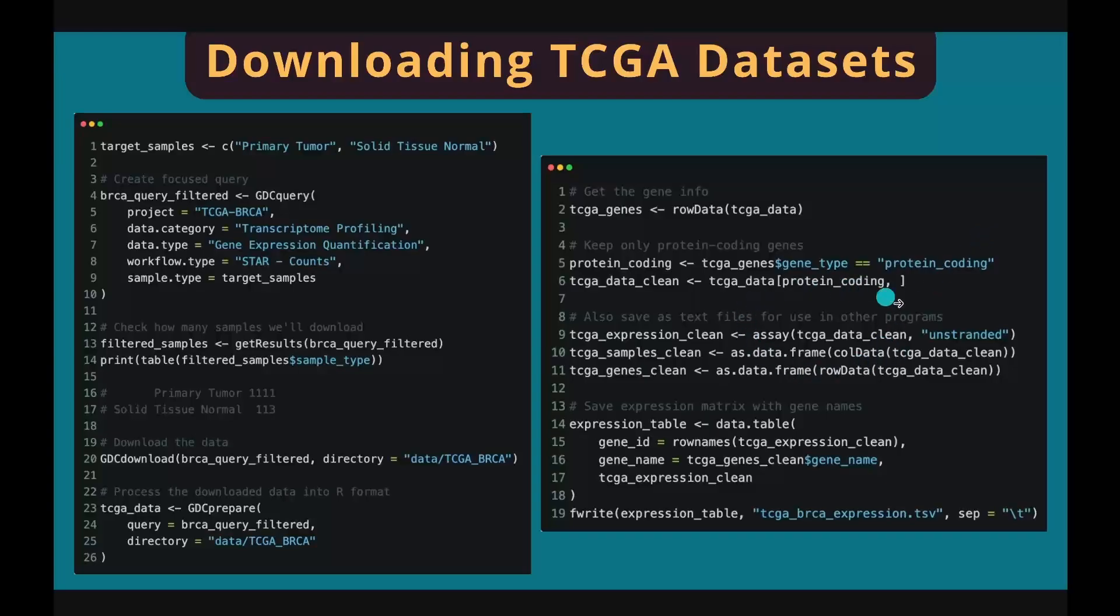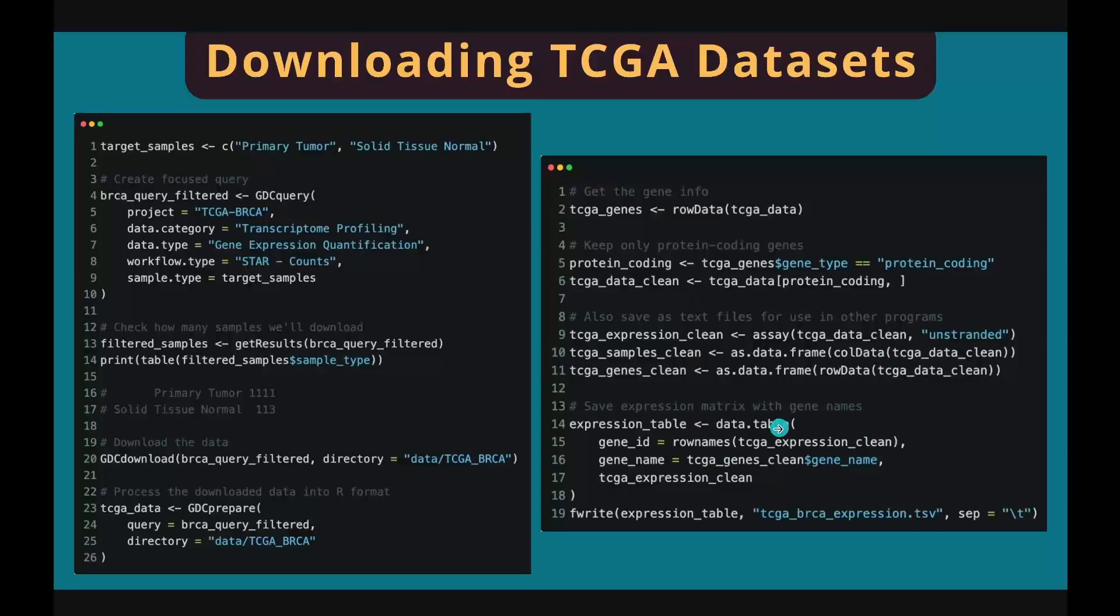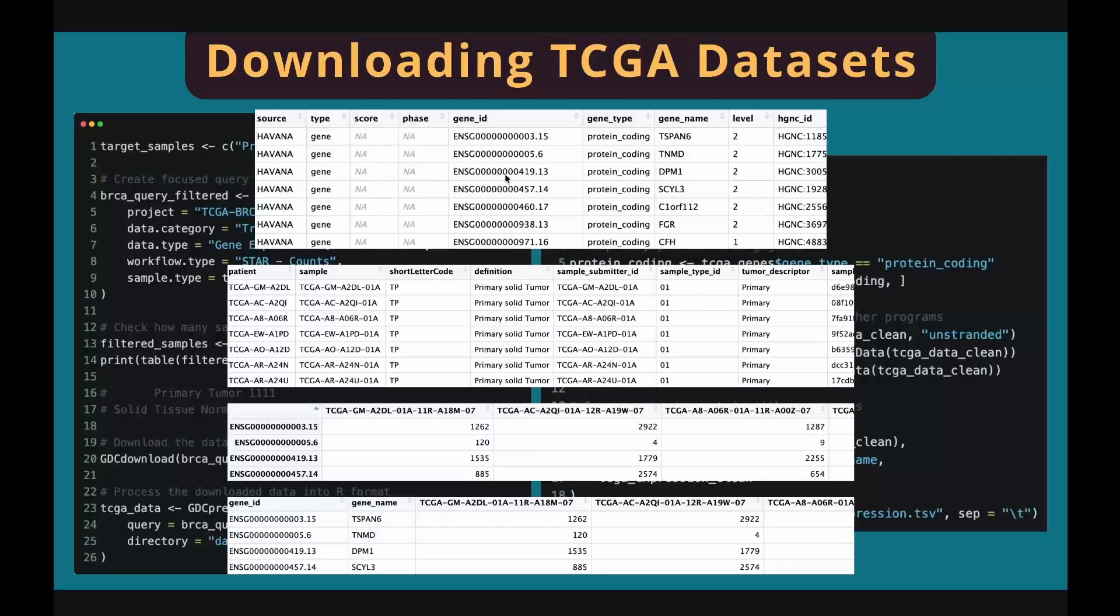The gene expression matrix extracted by the assay function doesn't contain gene information, but we can add the gene information back to the expression matrix by creating a new expression table using the data.table function and save the final expression table with gene information to your computer. This is the format of the gene information table extracted by the rowData function.